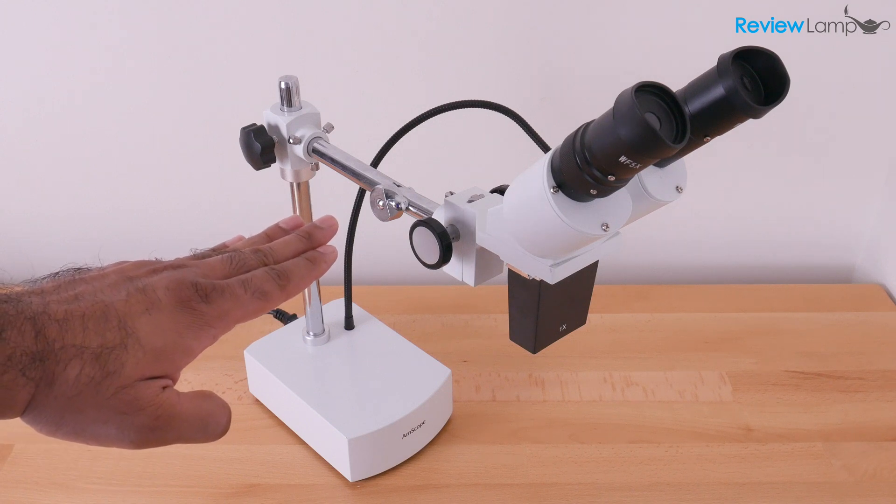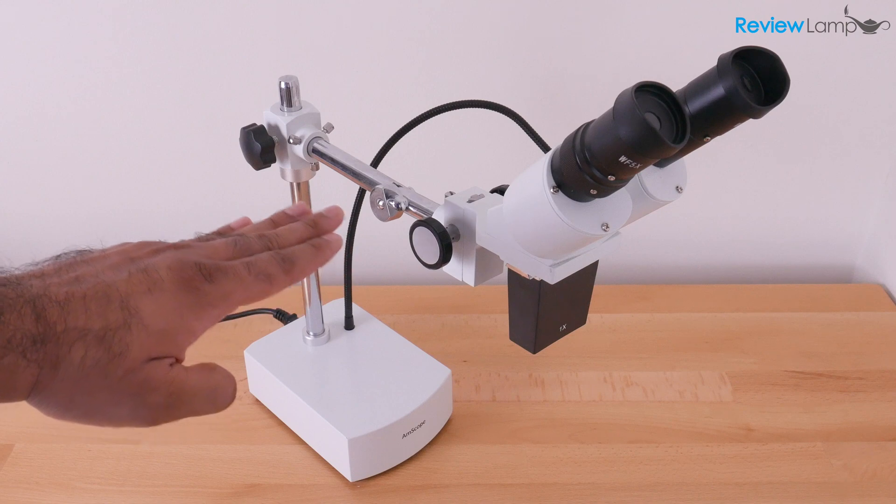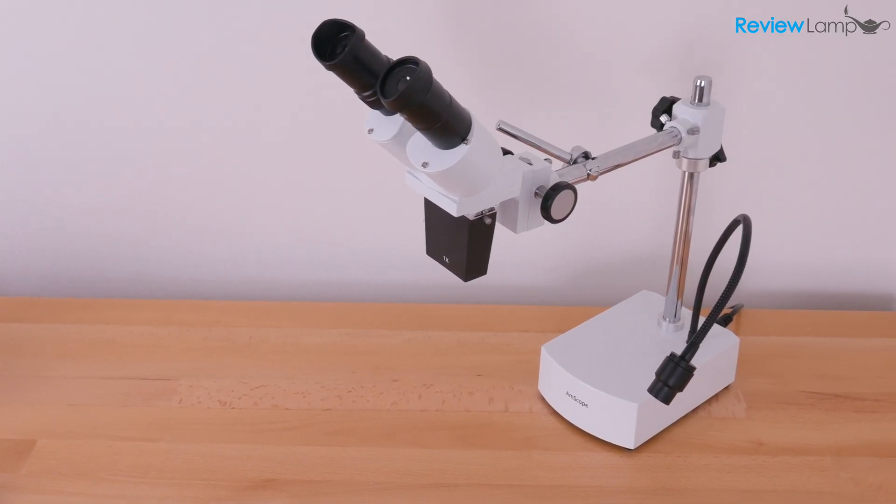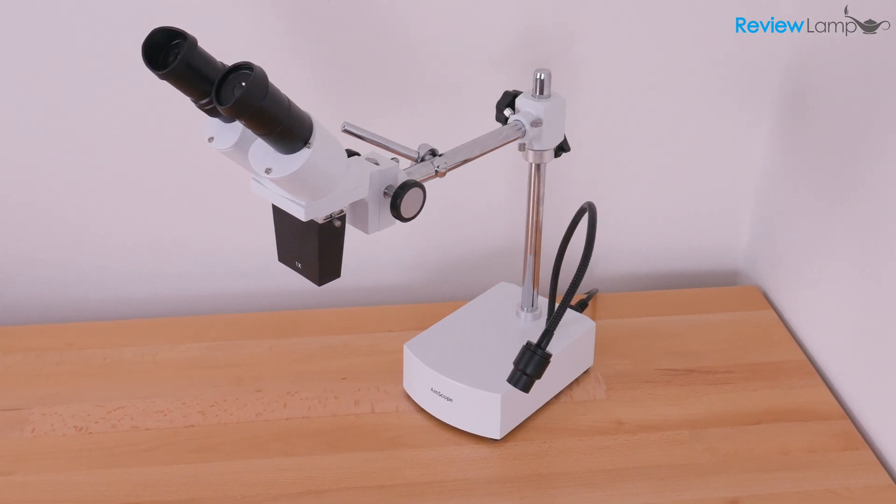So that completes the basic assembly and setup of the Amscope SE400 series. And if you're looking to buy this series of microscopes, I'll leave a link right below the video. So feel free to check that out.